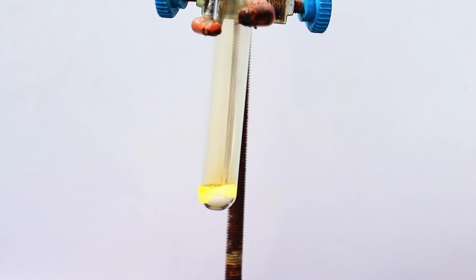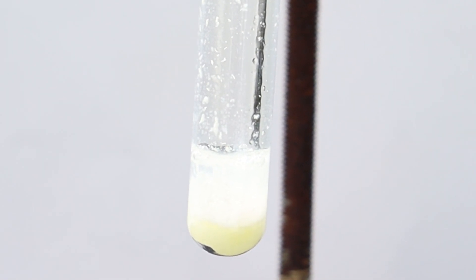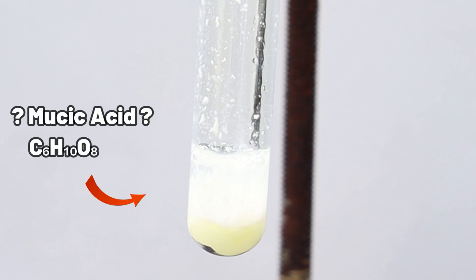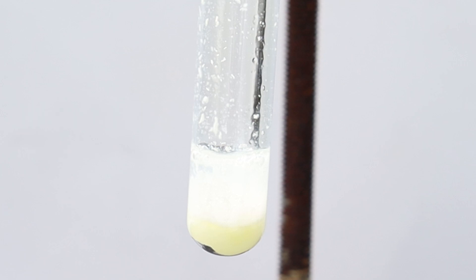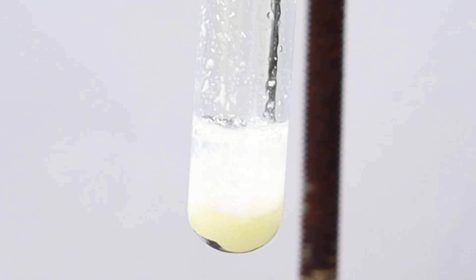Upon addition, nothing really happened, so I waited a bit and then added some water. Immediately a white precipitate formed. I think that it could be mucic acid, because it forms when galactose and its derivates, including lactose, are oxidized by nitric acid. It's virtually insoluble in water, so it precipitates out as a white solid. What else do you think it could be? Write your guesses in the comments.